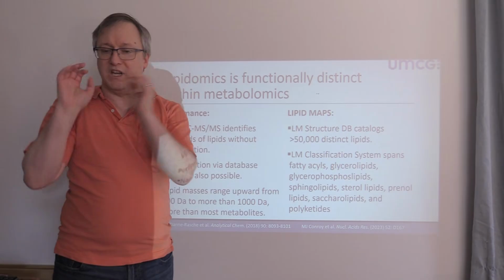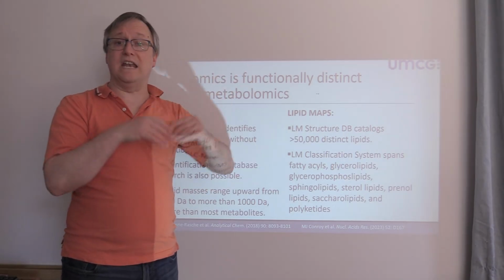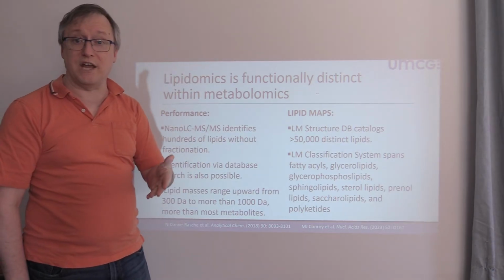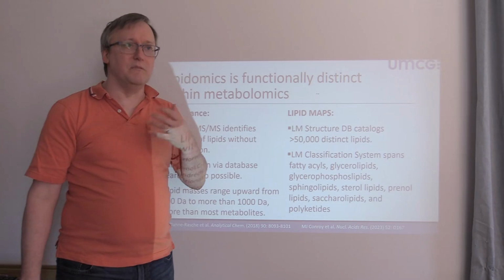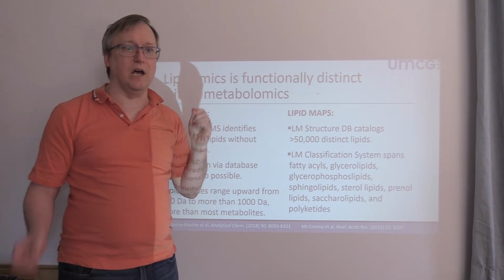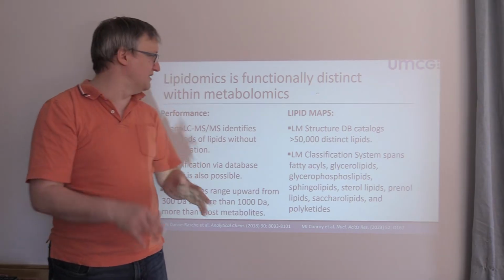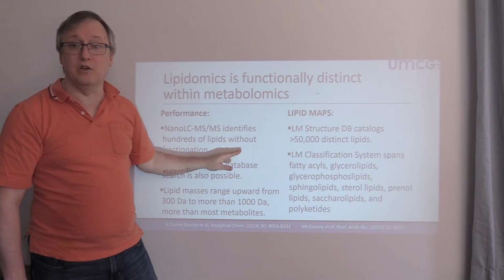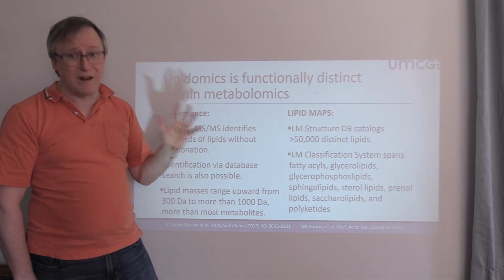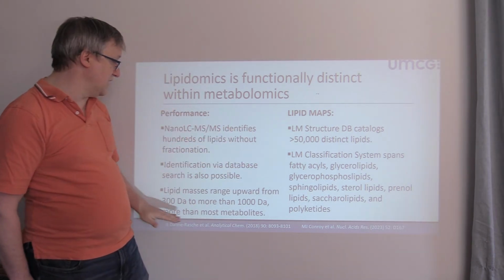So basically, each sample leads to one LC-MS experiment, and now we can identify hundreds of lipids in just that one shot. So this is not perhaps as complex a mixture as what you'd see in a whole cell lysate that's been digested to peptides. But in this case, you can still identify quite a few compounds using roughly the same equipment as what you would see in a proteomics experiment.